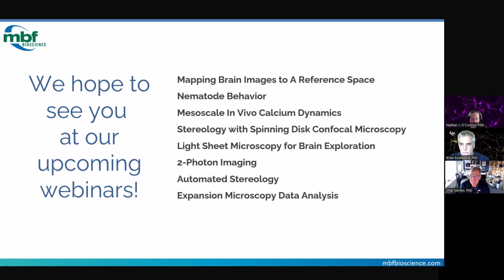Another MBF-specific question is, can you take a section registered to the Allen Brain Atlas and then use other MBF software probes such as Spaceballs or Optical Fractionator? The answer is absolutely. You can draw your regions, and we'll get into a little of this in the next webinar, save them as an XML file, one of MBF's data file formats, and then simply import that into Stereo Investigator and go from there.